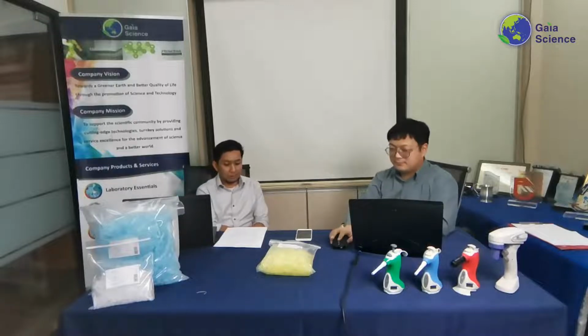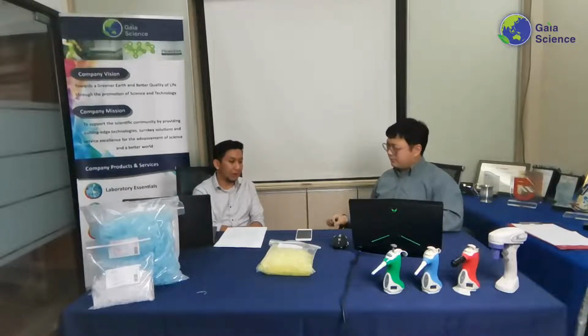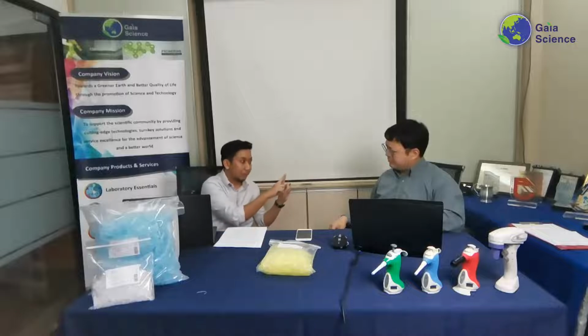I think those are the few conditions for a very advanced researcher that might use filter tips despite already being very familiar with the techniques. I believe there are also cases in cell culture work, or when things are very sensitive to contamination, where there's a safety technique telling you that you cannot simply use this pipette for different work.